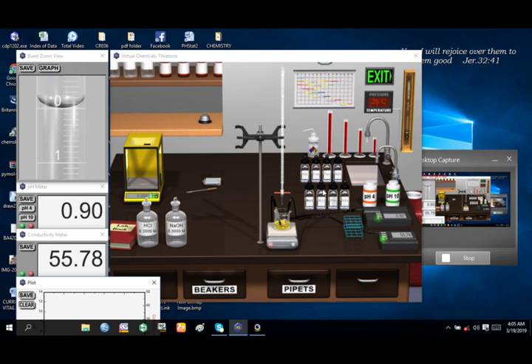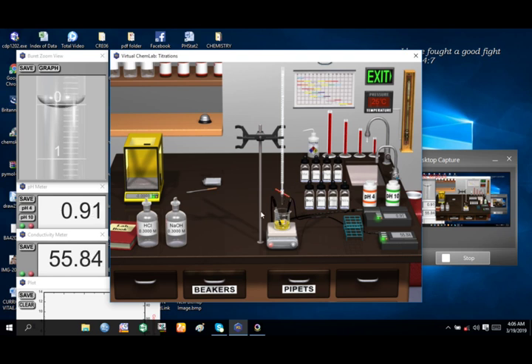Then as you go through the lab, as I'm pointing the cursor to you, you see various indicators. We're about to start the experiment. All you need to do is to click. You see, we started the titration. And you now can see the titration running on your left on the burette. Look at it running.